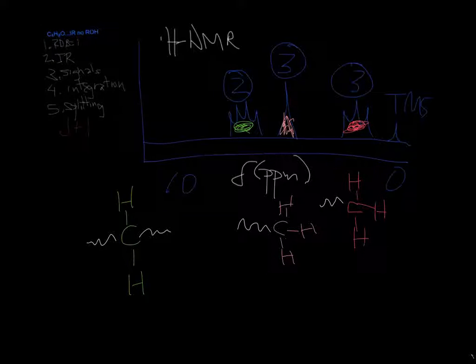3. Okay, so what that means is J plus 1 is equal to 3. Therefore, J is equal to 2. Yay, see, algebra is handy. That means that the carbon or carbons next to it have a grand total of 2 hydrogens.